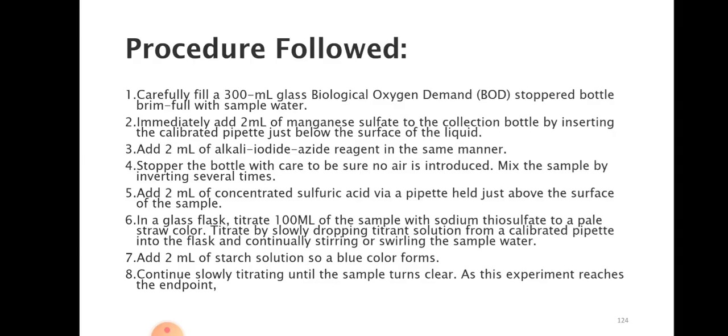First we are going to take a 300 ml BOD stopper bottle. This is a special type of stopper bottle we are using. In this we are going to fill 300 ml of water. In this water we are going to put 2 ml of manganese sulfate below the surface of liquid. Then after we are going to add 2 ml of alkali iodine azide reagent. And we will keep a stopper on this bottle. We will mix it properly and keep it under dark for 15 minutes.